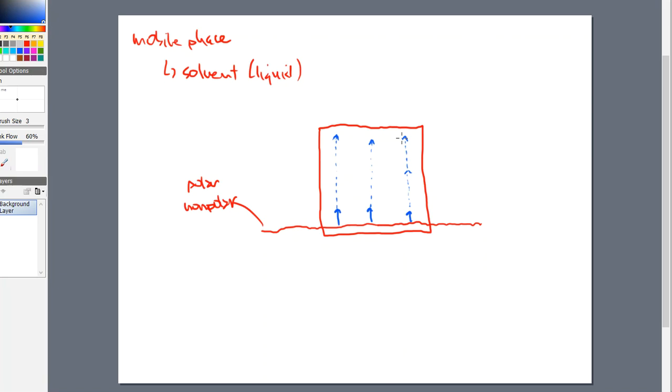The problem here, though, is that you have to choose a plate size that will make sure that separation actually occurs. If you choose too small of a plate, you will not give these components time to separate fully like they should, and your calculations are not going to make any sense. If you choose huge plates in the very end of this experiment, you'll wait forever and ever and ever, but you will guarantee that your measurements will work out the proper way. So it's almost like a Goldilocks routine here, right? Too hot, too cold, just right.